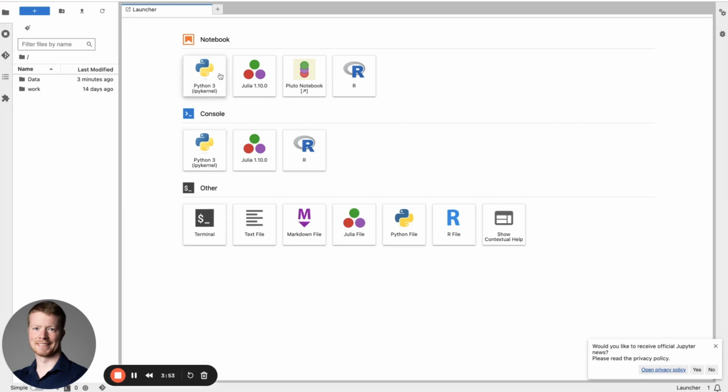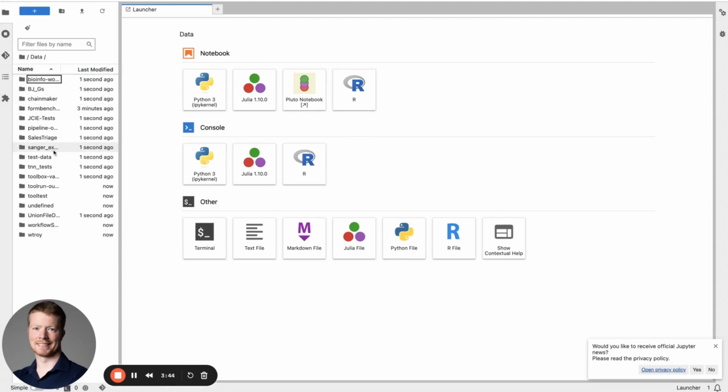In this new tab, you can start whatever you want. It'll have all of your files within it. Here you can see all of our files that are on this project, and you can manipulate them however you want or download them, and they will be in your project bucket after the session.